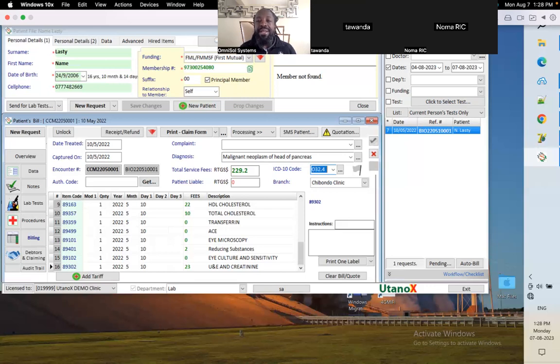Something you can do, but really only for maybe the first 2-3 weeks, but have a plan in place to be working on a cable network, because it's just much more stable. The work you do in a lab is too sensitive for you to have a network which is up and down all the time. Eventually, you may become upset with the system because of the network. So we don't want that.